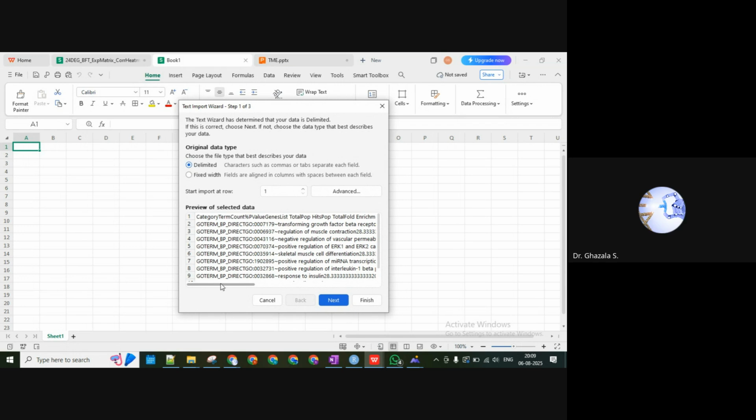Okay, so let's discuss that in the primer section only, because if there are no already defined overrepresented sequences, then we'll first identify them within the gene sequence, and then we'll go for primer designing. Okay, that we can do later, because today itself we are doing a lot of things.